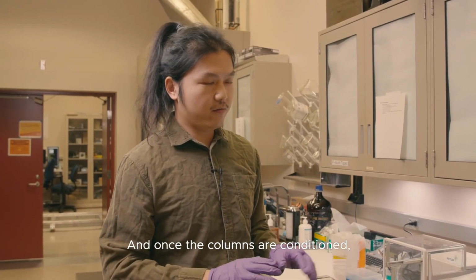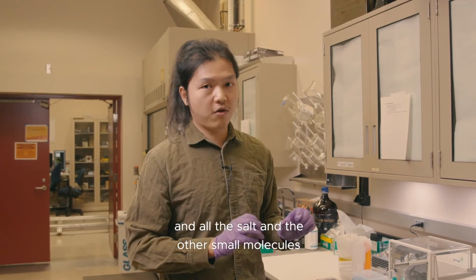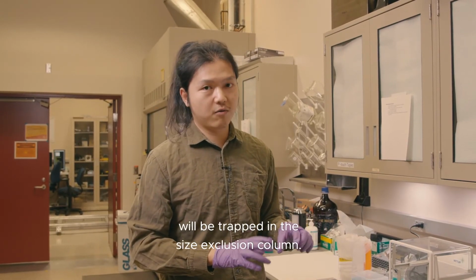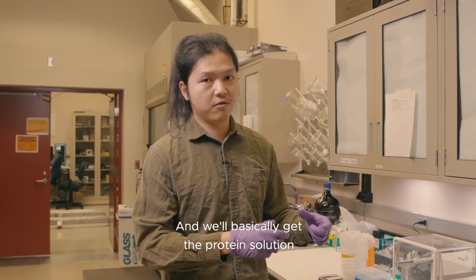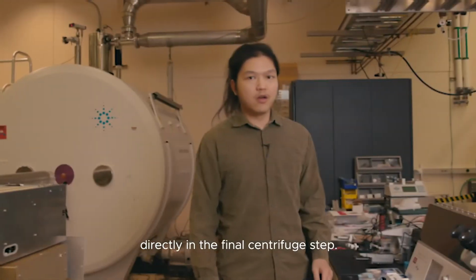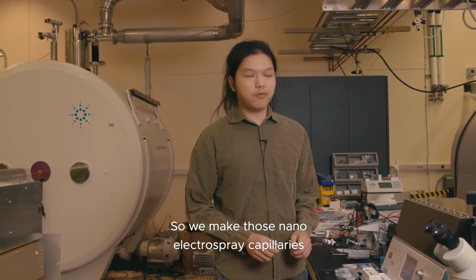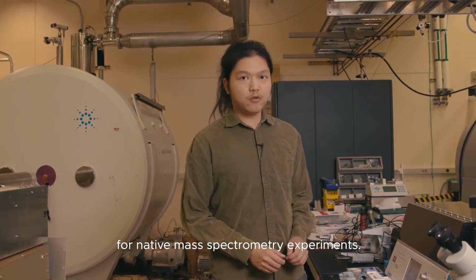Once the columns are conditioned, we load the samples onto the column, and all the salt and other small molecules will be trapped in the size exclusion column, and we basically get the protein solution directly in the final centrifuge step.